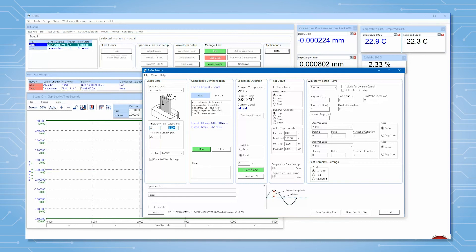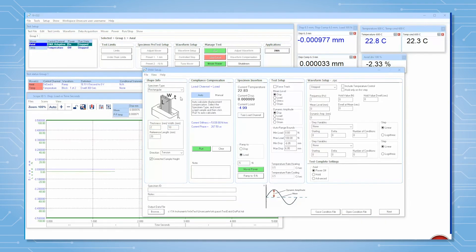Next, use a caliper to measure thickness and width of your sample and type them in. Save your test file.